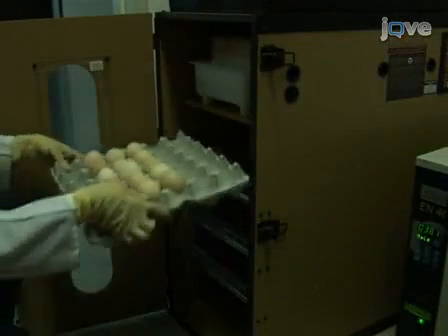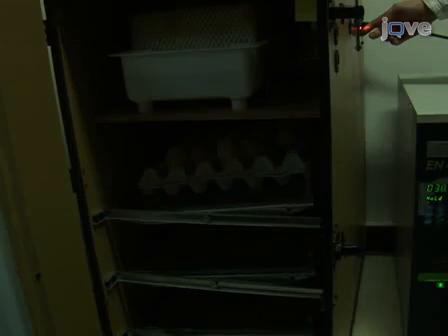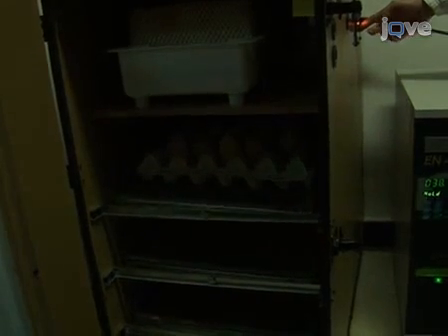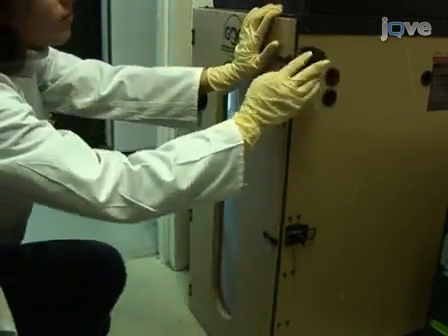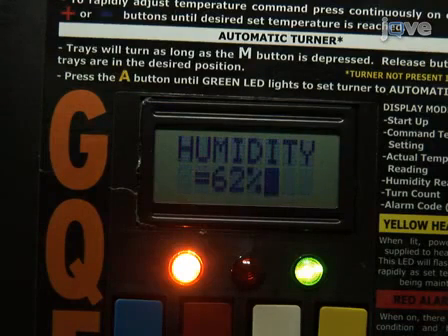To begin this procedure, transfer fertilized white leghorn chicken eggs from room temperature to a humidified incubator, preferably with rocking trays, at 37 to 38 degrees Celsius. It is important to monitor the temperature and humidity of the incubator in order to obtain viable and synchronized embryos.